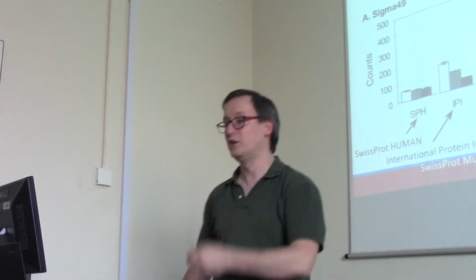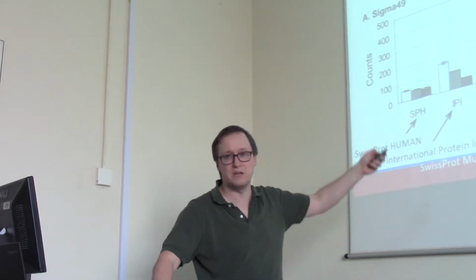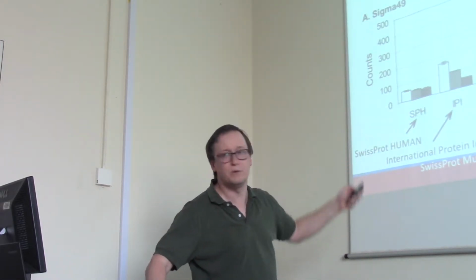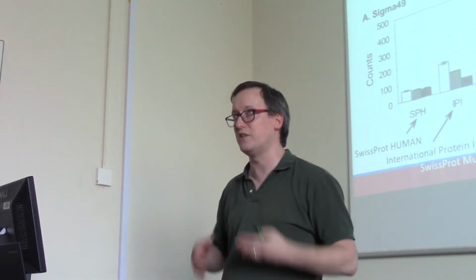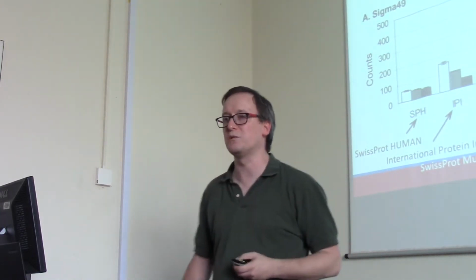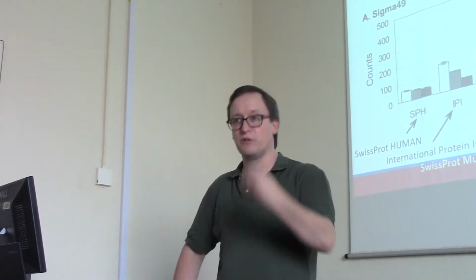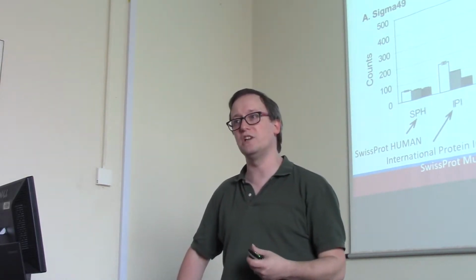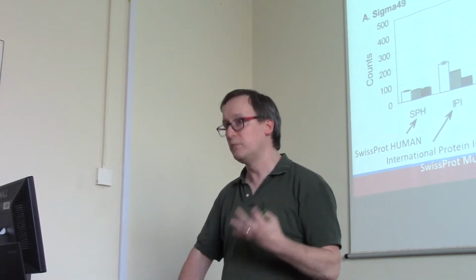Well, now you have an even smaller list. And even if you start with a massive sequence database, the number of proteins you invoke no longer rises with the size of your sequence database. So it actually has a rather big effect on the number of proteins we claim. Parsimony is considered a necessary element of protein calling by most people now.